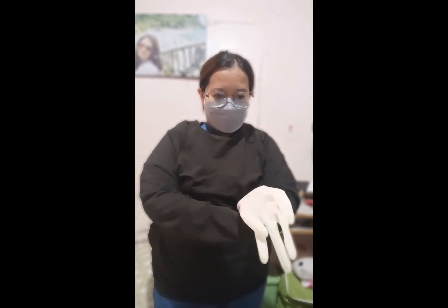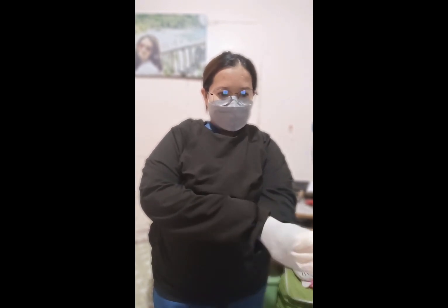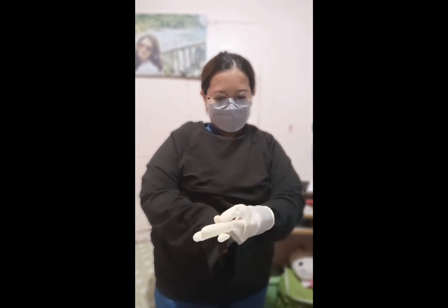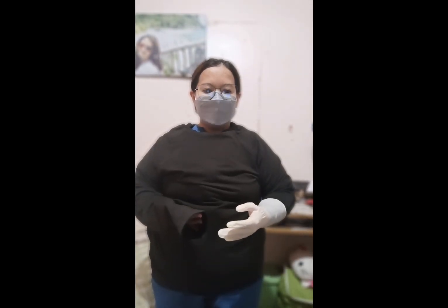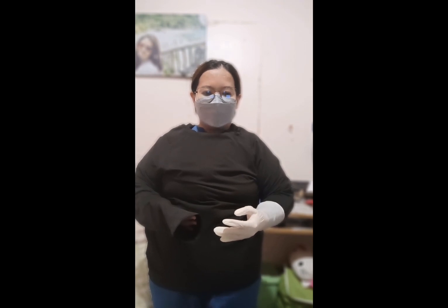Next, while holding the glove's cuff edge with one hand, grasp the uppermost edge of the glove cuff with the opposite hand. Continue to grasp the glove and stretch the cuff of the glove over the hand using the opposite sleeve-covered hand. Grab both the glove's cuff and the sleeve seam, and pull the glove onto the hand. Next, using the hand that is now gloved, put the second glove on in the same manner. Check to make sure that each gown cuff is secured and covered completely by the cuff of the gloves.